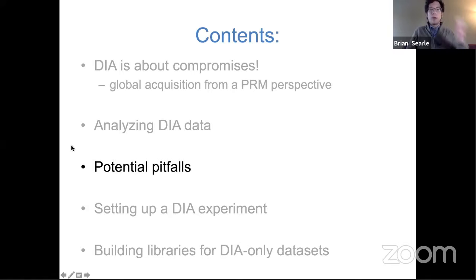Now, a lot of people think that you can only ask spectrum-centric questions of DDA and peptide-centric questions of DIA, and that's not true at all. As I said earlier, DIA-Umpire and PLGS from Waters try to take DIA data and convert it into a framework where you can ask spectrum-centric questions about that data. Conversely, Bing Zhang, for example, has developed a peptide-centric search engine for DDA data that can scan for any particular peptide: do I have evidence across all of my DDA data sets for that peptide being present?